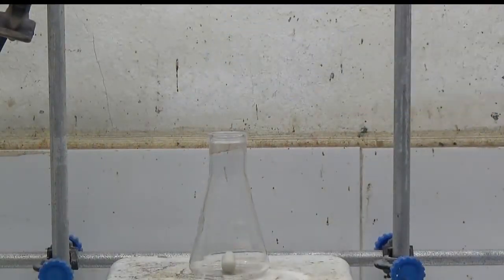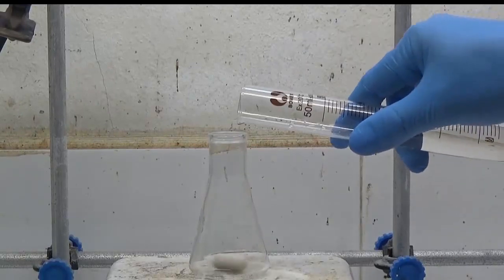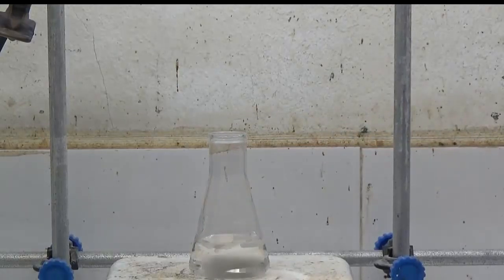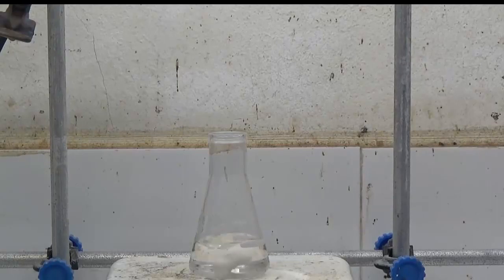Furfuraldehyde reacts with aniline acetate to produce a red colored solution. The identification of furfuraldehyde will involve aniline, acetic acid, and a dilute solution of furfuraldehyde.